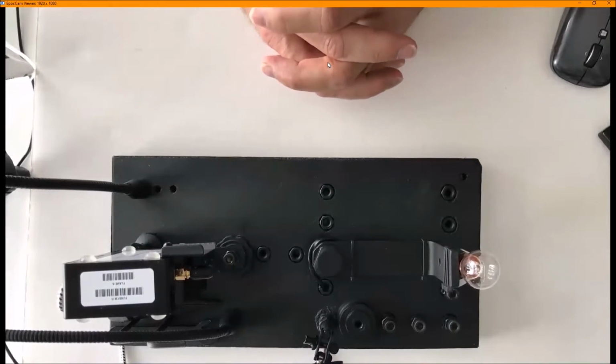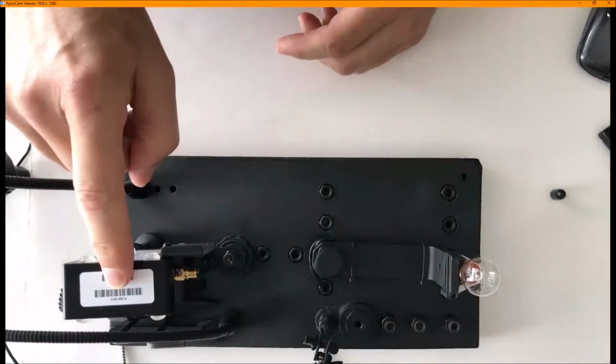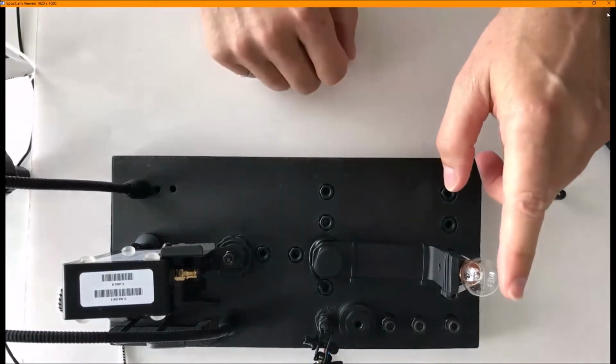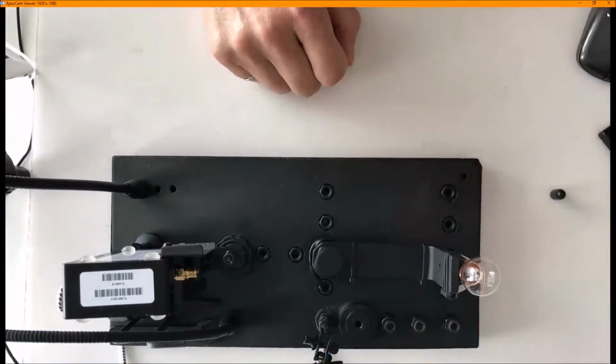In this fourth video, we will measure the reflection of many items, some which can be found in your home. First, let's describe the setup. This is the spectrometer, and this is the entrance to the spectrometer in gold. And on this side, we're going to have a known light source. Let's turn it on.